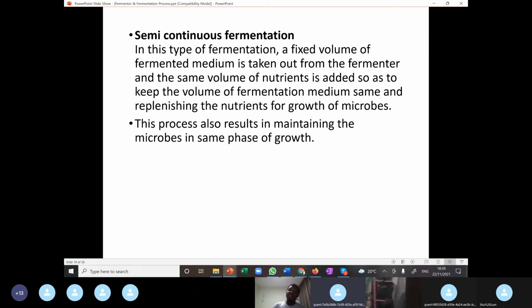We adjust both the fresh nutrient and spent nutrient. I will also adjust the inoculum and the products. So we could be harvesting and removing waste, and also at the same time adding fresh nutrient and also fresh inoculum. Again, we could want to maintain a particular pace of the growth cycle.